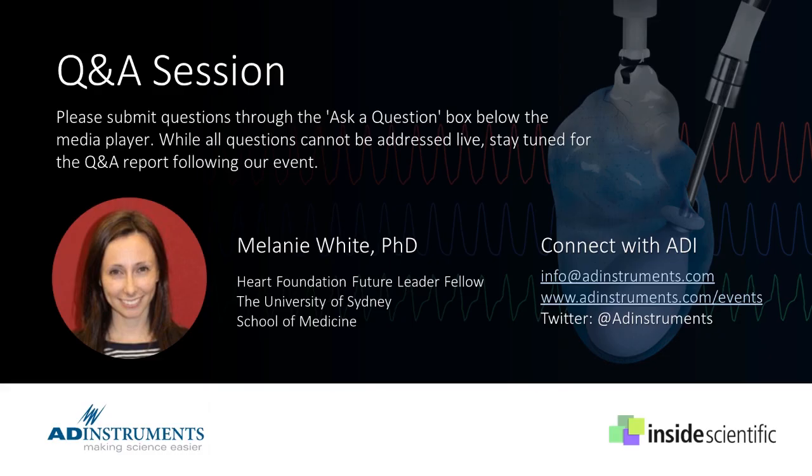Okay, perfect. Now, in the interest of time, we'll just make this next question the last one. When perfusing with erythrocyte-containing solutions, do you have any advice on good measures to prevent hemolysis? That's a really good question, and one we are actually about to come to. In the past, we've only ever used crystalloid perfusion systems, and we're only now starting to think of moving across to erythrocyte-containing solutions. And that's simply because of the additional hands-on nature that's required. So if you have any advice to share with us on good measures to prevent hemolysis, I'd be really happy to have that chat.